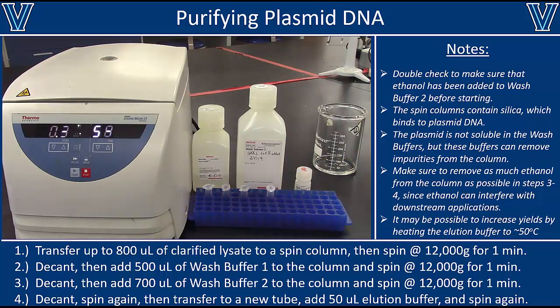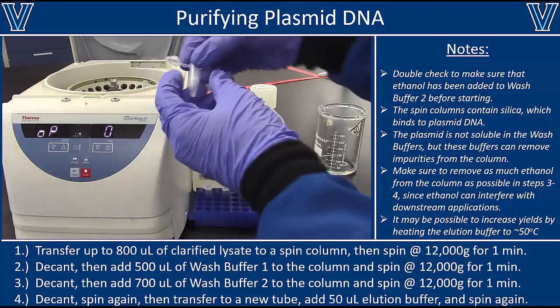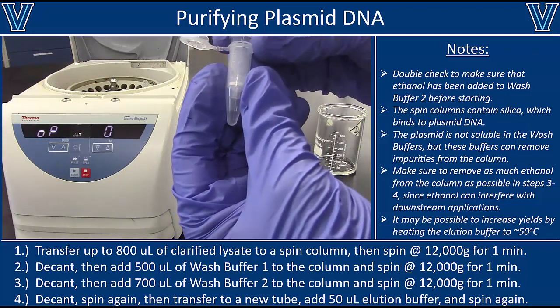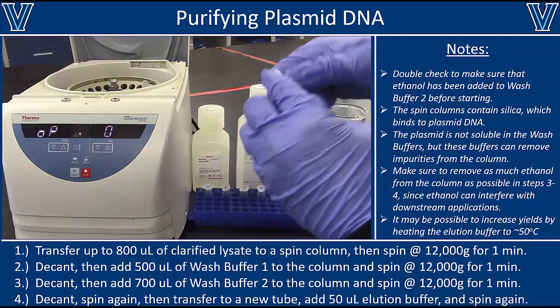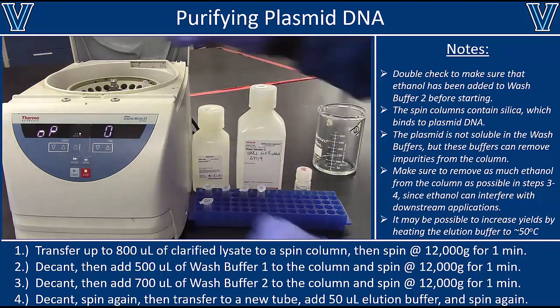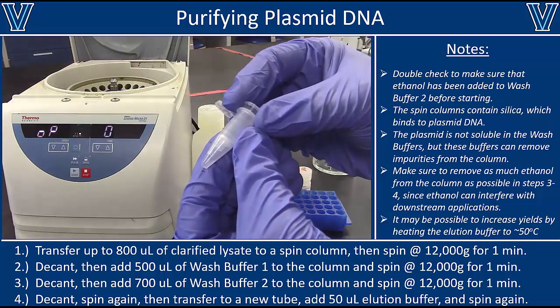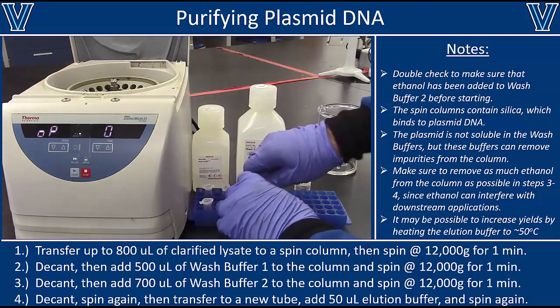All right, so we're going to centrifuge one last time, 12,000 G for 1 minute. And at the end of that spin, we're going to take our tubes out. And right there at the bottom of the tube, we should have a purified solution of plasmid DNA. At this point, you can remove the spin columns from the tubes and go on to quantify the DNA concentration with a nanodrop or Take3 plate.